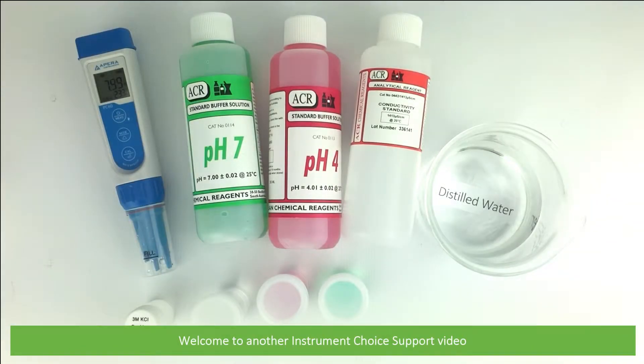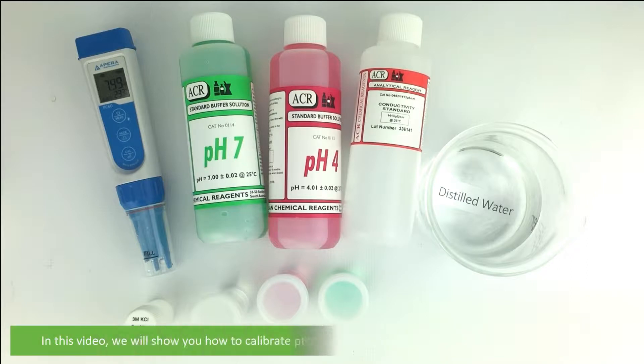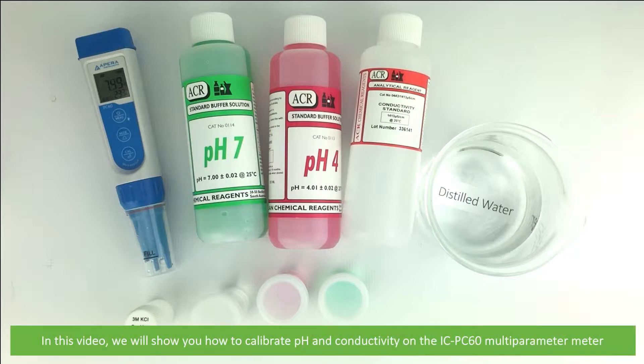Hi and welcome to another Instrument Choice support video. In this video we will show you how to calibrate pH and conductivity on the IC-PC60 multi-parameter meter.